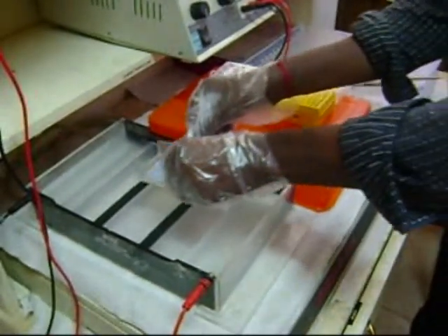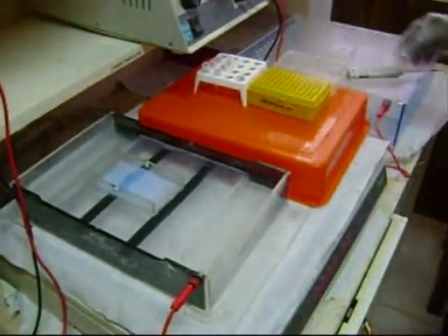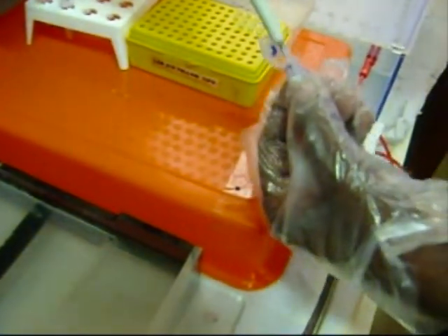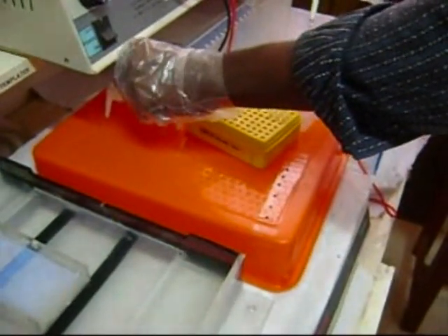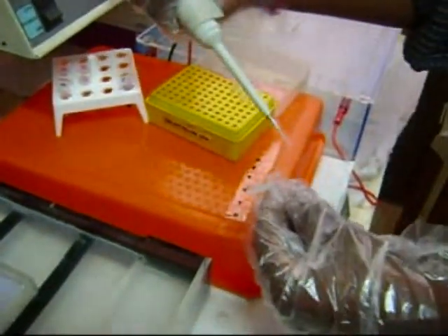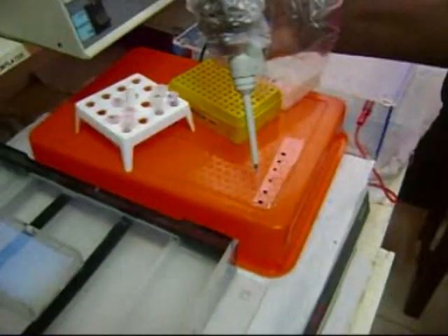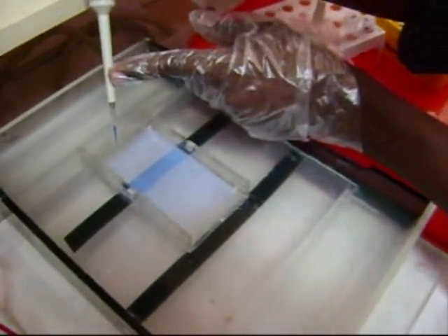The gel template is placed inside the tank buffer. For loading the sample, the loading buffer is placed on the parafilm. The DNA amplicons are mixed well with the loading buffer and loaded into the wells.